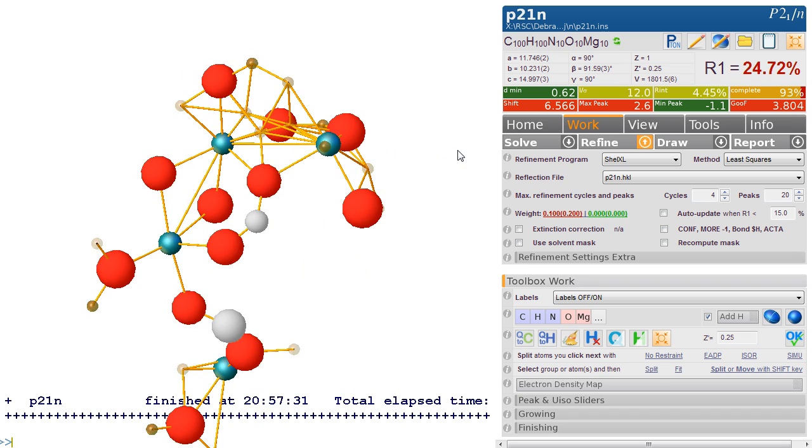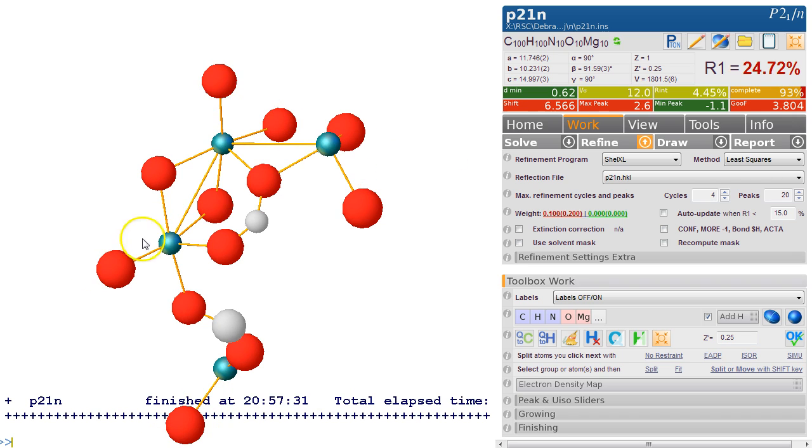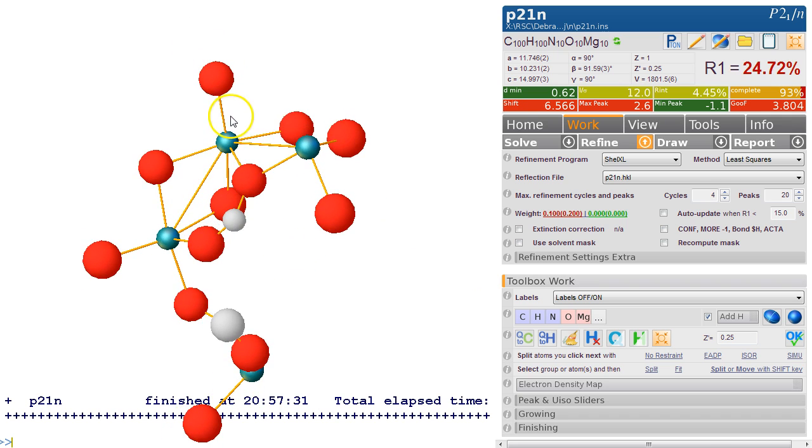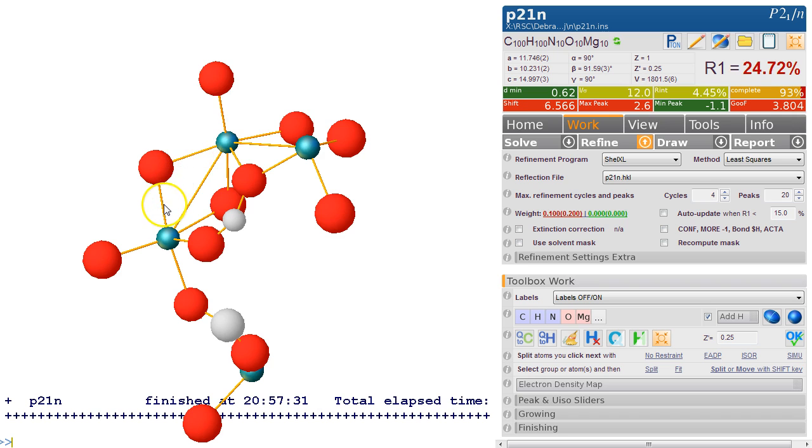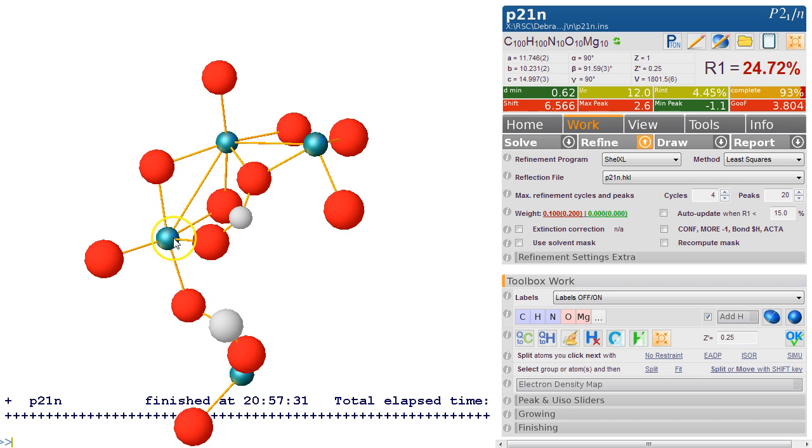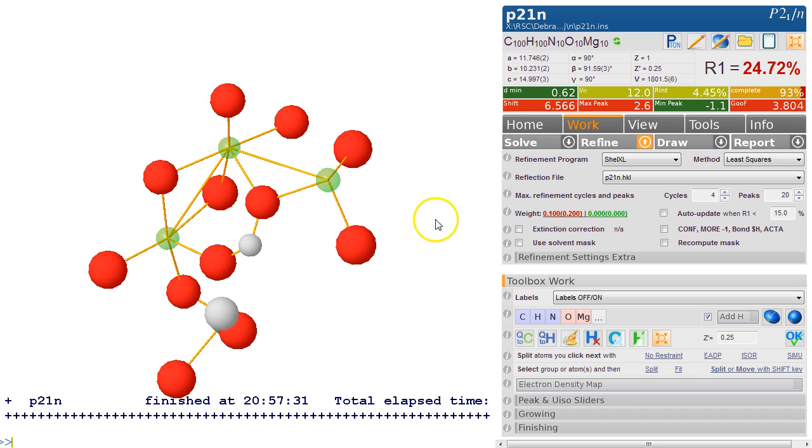Let's hover the mouse and see what it could be. That's 2.1—now that looks like a perfect first row transition element sort of thing. So let's try and make them copper. Let's try copper. So we go 'name Cu' and refine that.